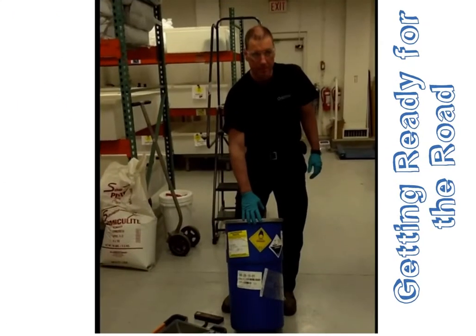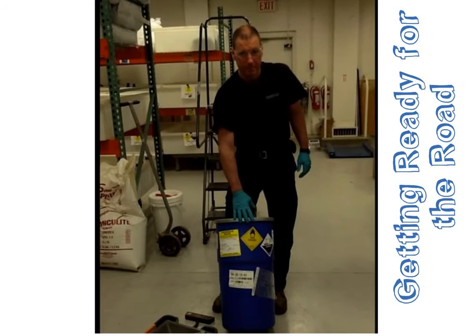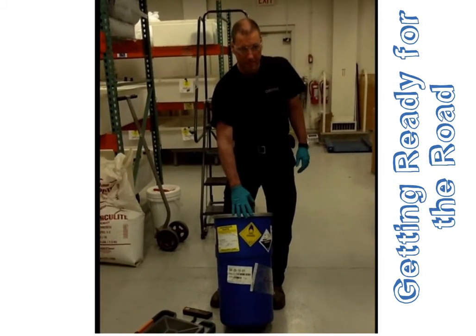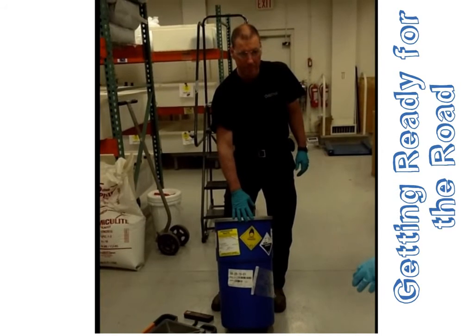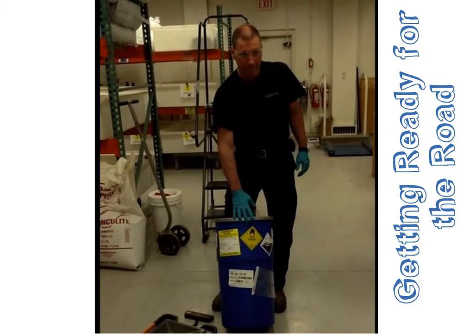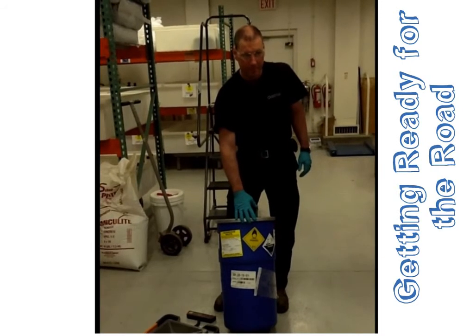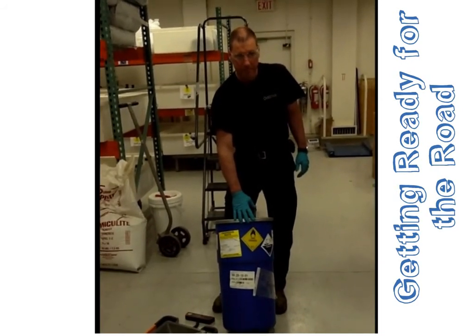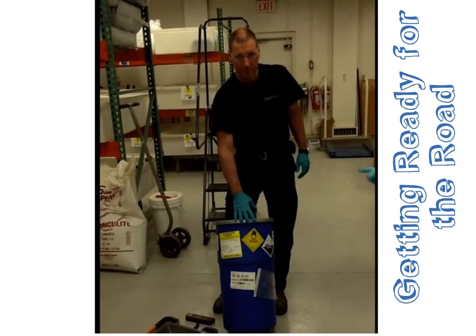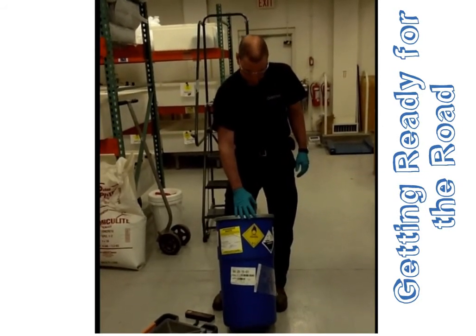This is Tom Shaw, our chemical waste technician. He is currently packing one of the containers that he's put a bunch of bottles into. This one is ready to go. This is a DOT package. It has this waste label on it for shipping. It also has the DOT hazard labels. This one is an oxidizer. It is also corrosive.